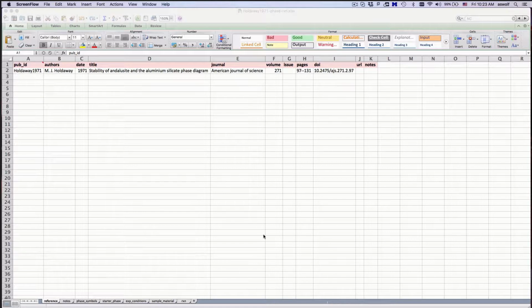Hi everyone, Aaron here. I'll admit it, data digitization is not exactly the most thrilling activity, but it is crucial to science. Without having data well organized and accessible to a computer, modern science has nothing to work with. That's why here at Enki, we are doing our best to make data digitization as streamlined and painless as possible.